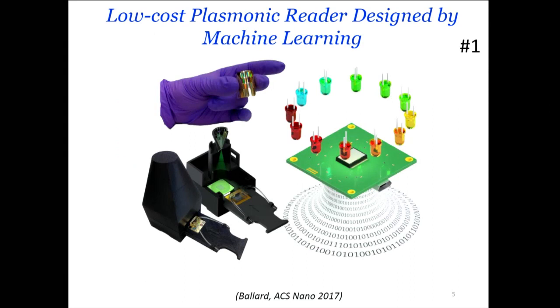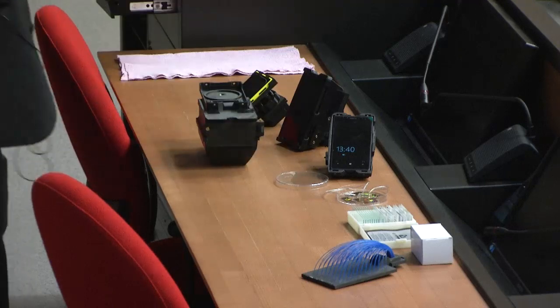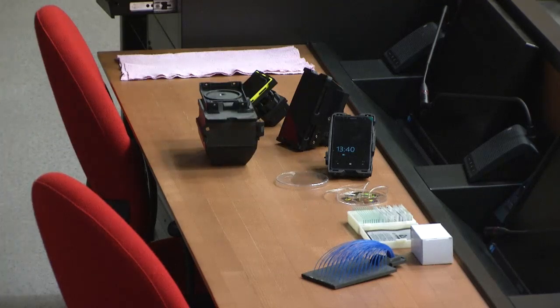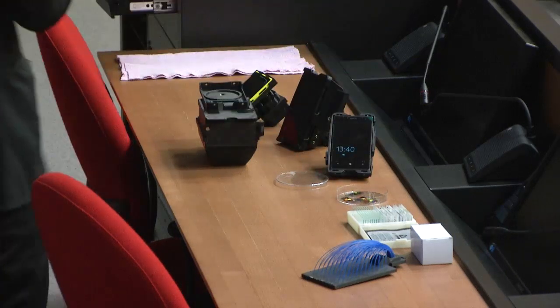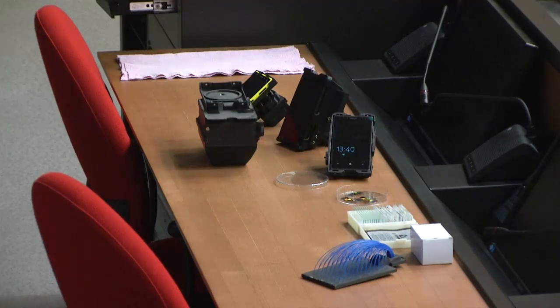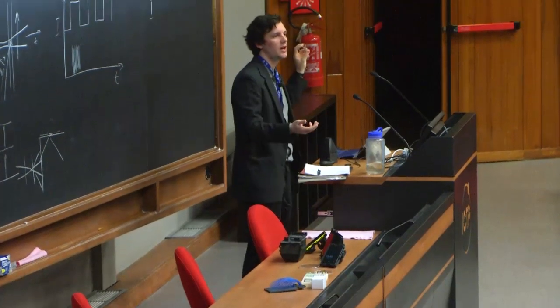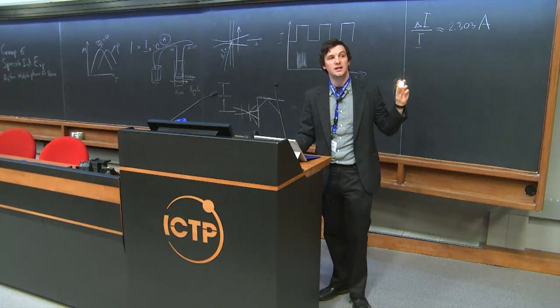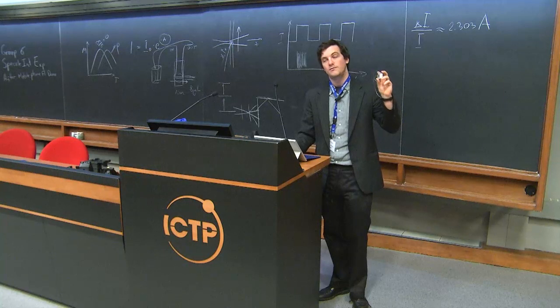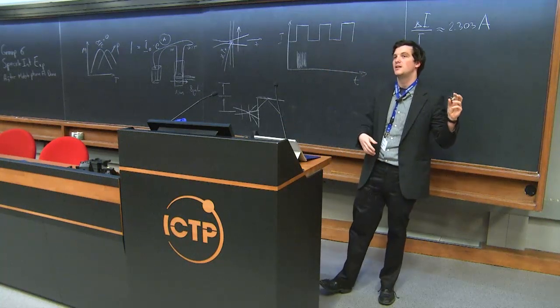So first, I'd like to just briefly go over what the plasmonic reader is. So that's this device with the dome on top. And this reads plasmonic sensors. Plasmonic sensors are an emerging type of sensor for detecting and sensing protein concentrations. There's work recently that's been published that actually can get a virus count in a given blood sample, an unprocessed blood sample.